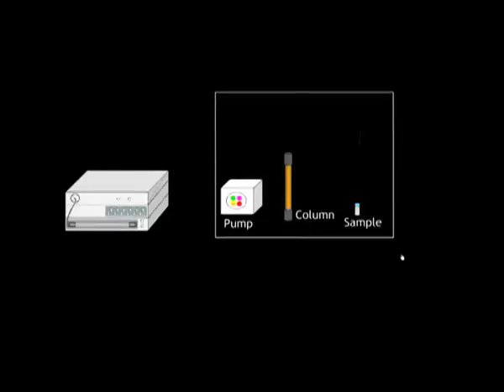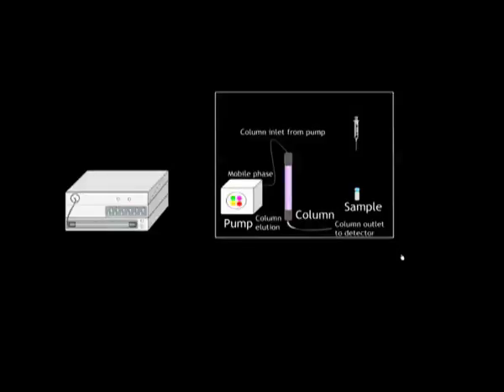The complex protein mixture is further separated by SDS-PAGE to simplify the analysis. Further separation is carried out by liquid chromatography, and purified peptide fragments are analyzed by MS.